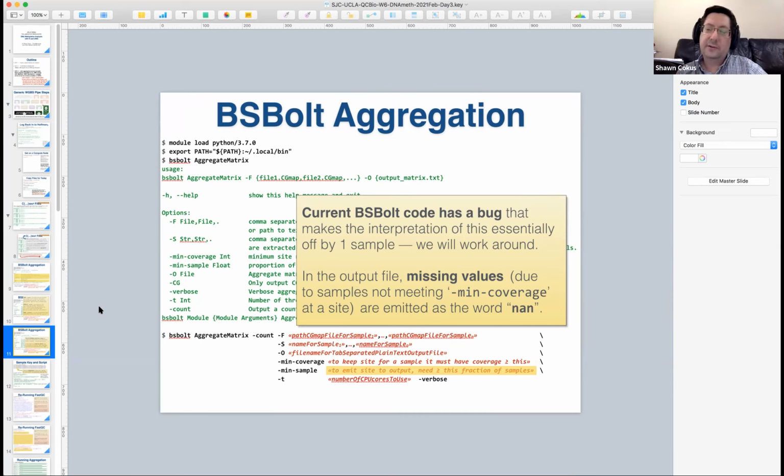If we wanted a threshold of 0.75, probably makes more sense to give a number like 0.6, something halfway between 0.5 and 0.75, because then the fuzziness of converting that to the internal thing doesn't move you across a boundary point, right? If you put in 0.6, 0.75 is certainly above 0.6, and 0.5 is certainly below 0.6, and it's not really ambiguous, right? So it feels safe.